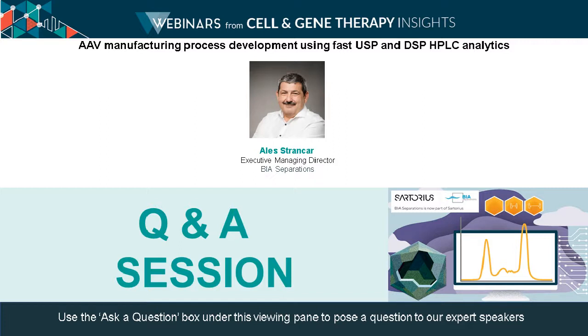If plasmids are not pure enough, then you may see quite some issues. In some cases, it is maybe even good to not use three plasmids, but maybe two plasmids and one dog bone. So there are many different possibilities to improve the quality of your expression.